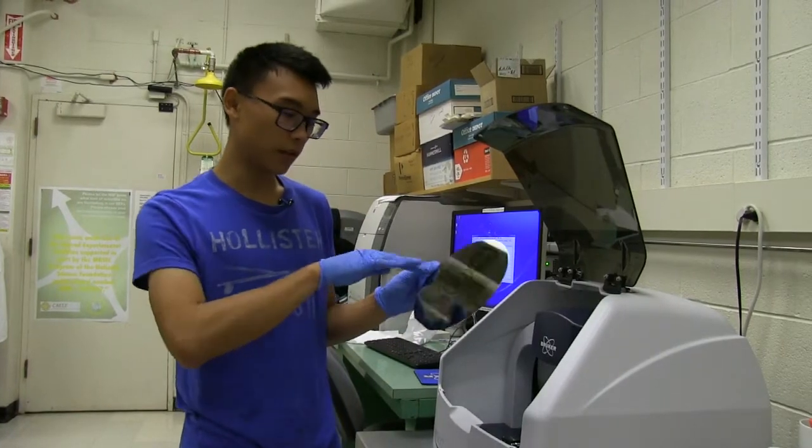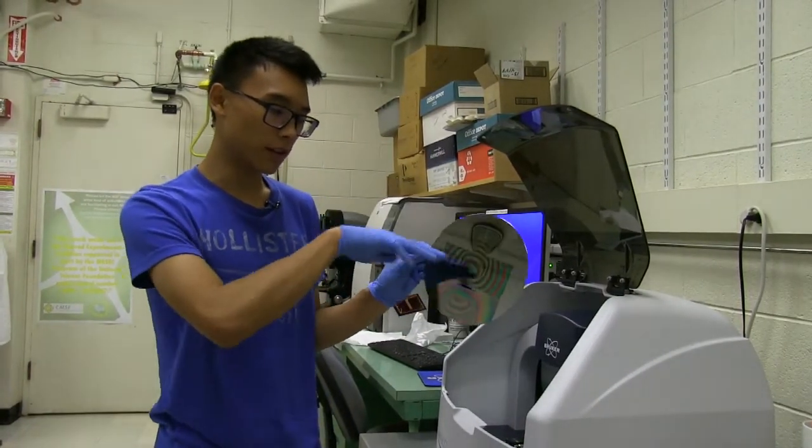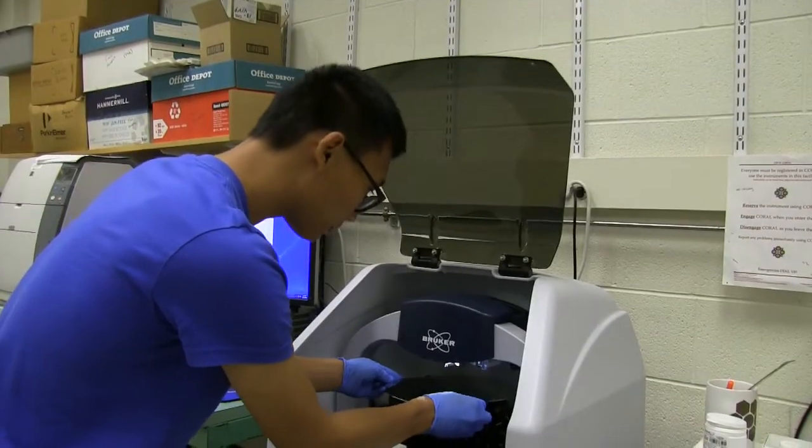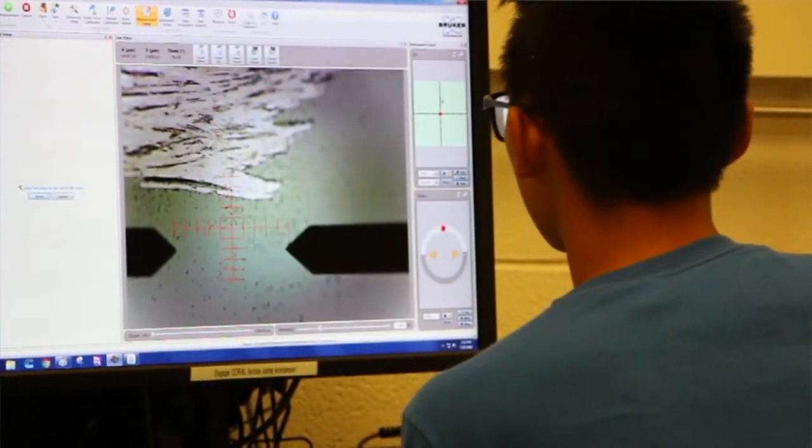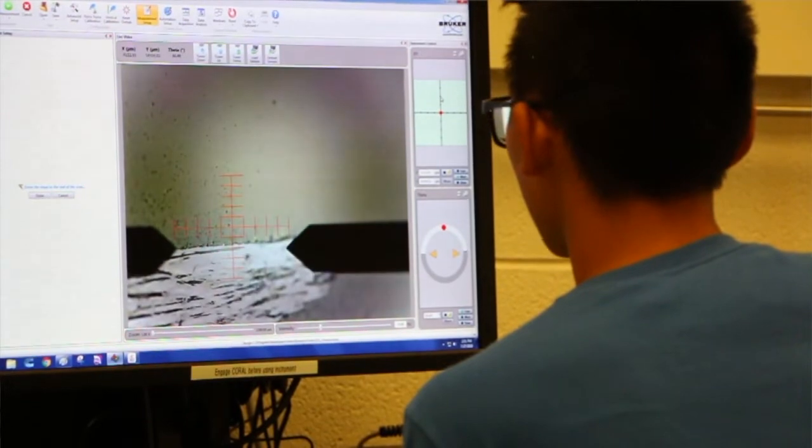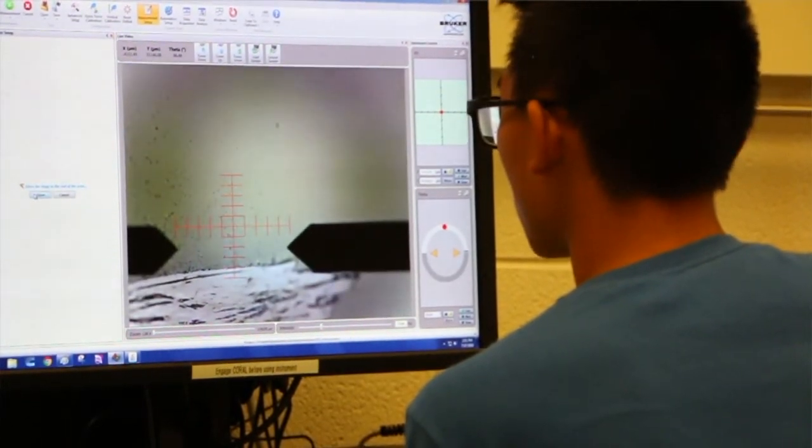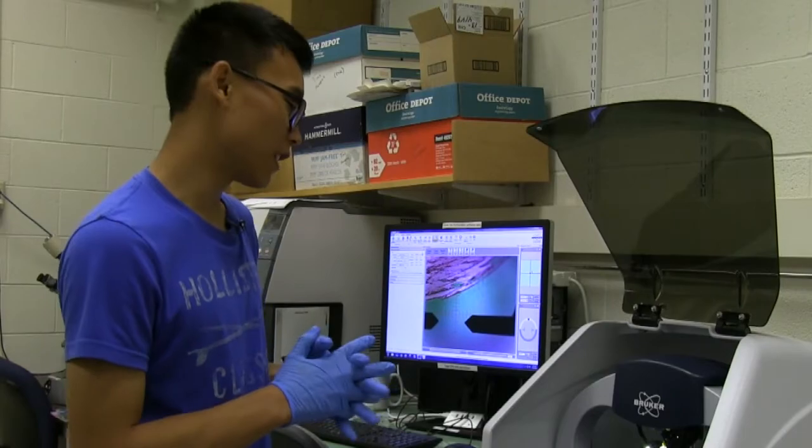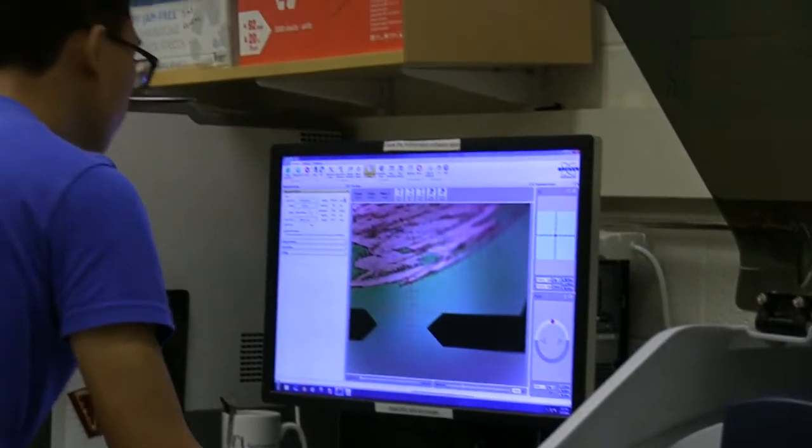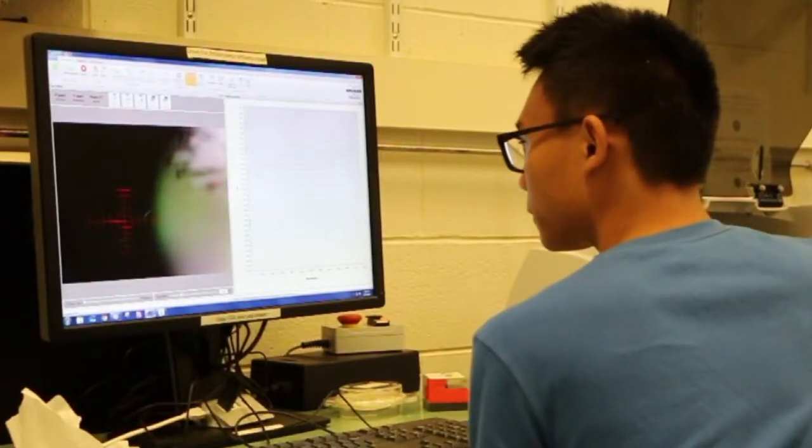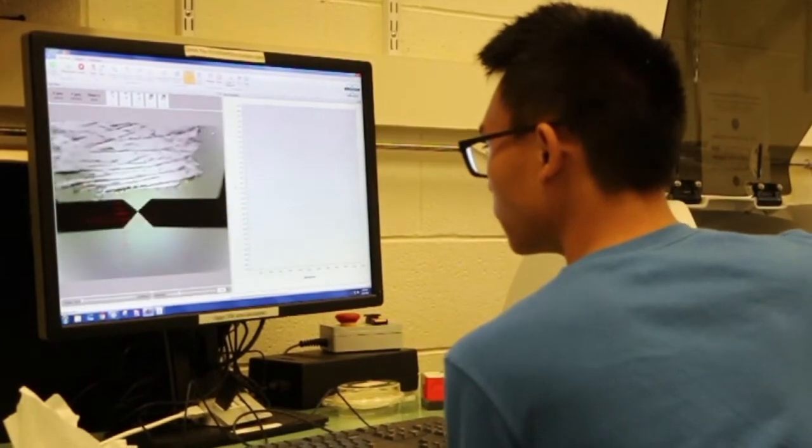It's just seeing the profile in this direction because we already measured in the other one. This stage can be moved in the X and Y directions or it can also be rotated. Before I take any measurements, I have to first adjust the stage so that it will be measuring in the right direction.